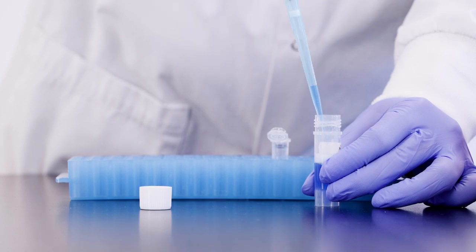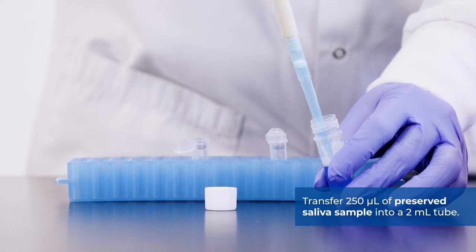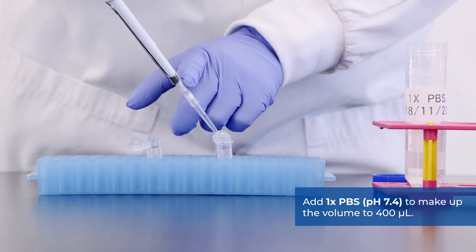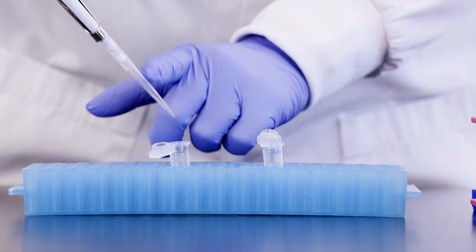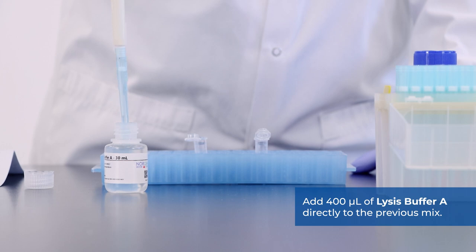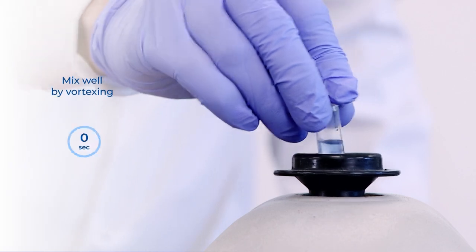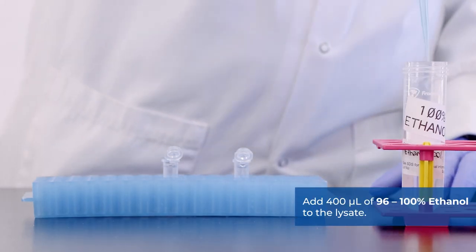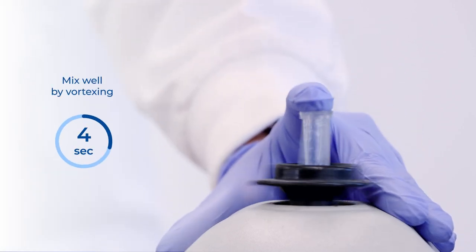To prepare your saliva samples, transfer 250 microliters of preserved saliva sample into a 2ml tube. Add 1xPBS to make up the volume to 400 microliters. Add 400 microliters of lysis buffer A directly to the previous mix. Mix by vortexing for 10 seconds. Add 400 microliters of 96 to 100% ethanol to the lysate. Mix by vortexing for 10 seconds.